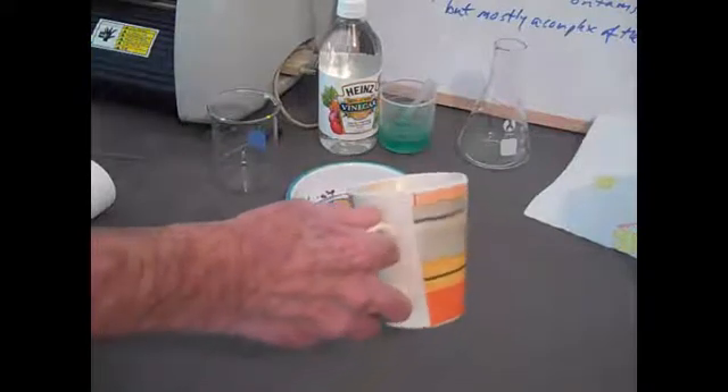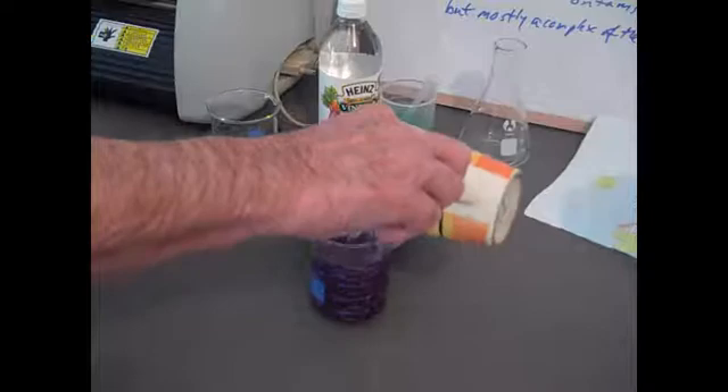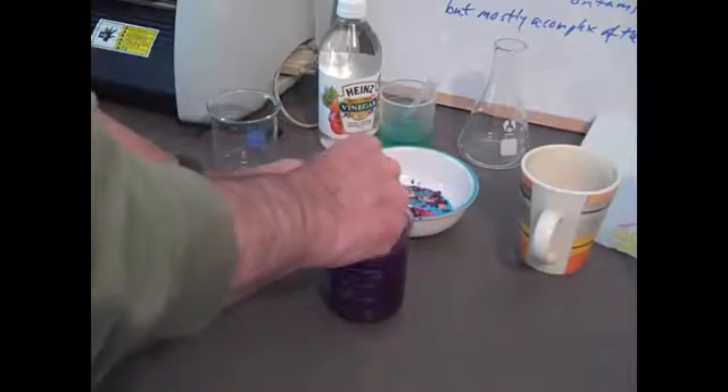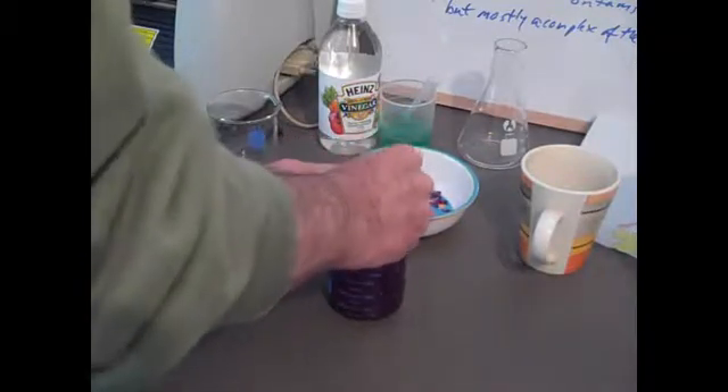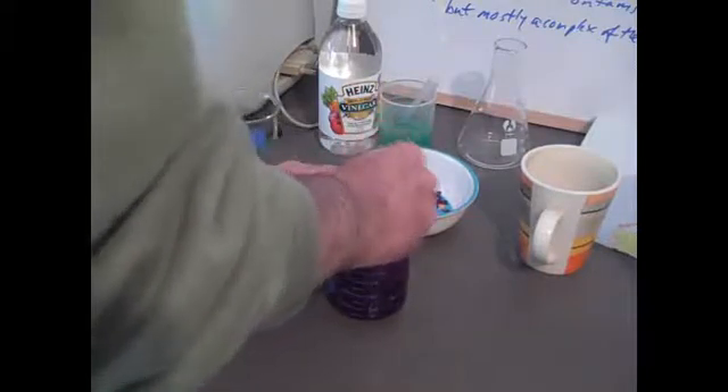Here's some water recently boiled in a tea kettle. We pour it into the beaker — about half a cup — stir it up, and try to crush the red cabbage leaves that have been ground up so they release the pigment.